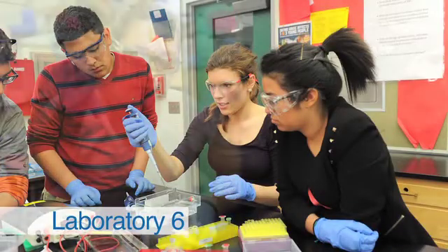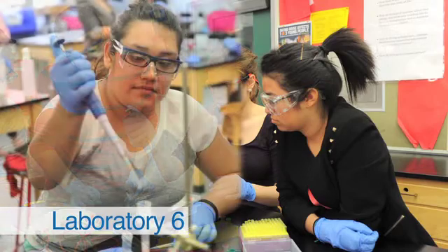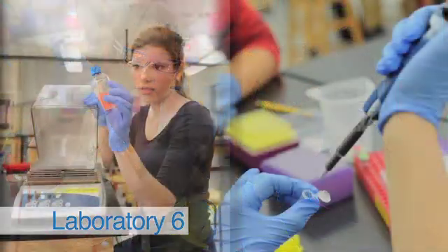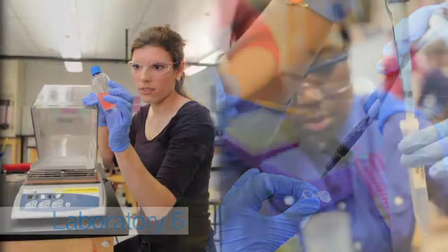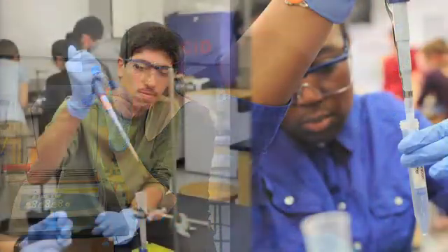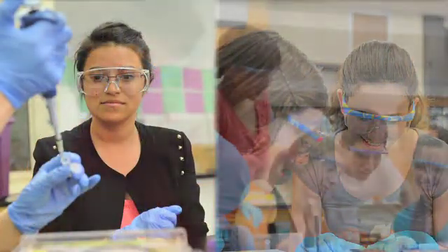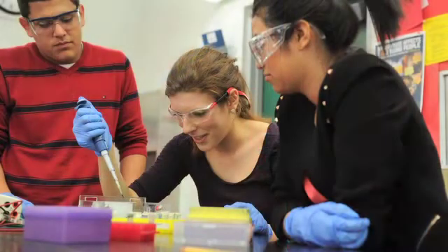Laboratory 6 represents the final steps in the overall process of genetic engineering that would result in producing large quantities of the therapeutic protein of interest, isolated from other components of the bacterial cell. Although students carry out this process on a small scale, it is important to help them understand that industry would use large bioreactors to produce amounts sufficient for widespread medical treatments.